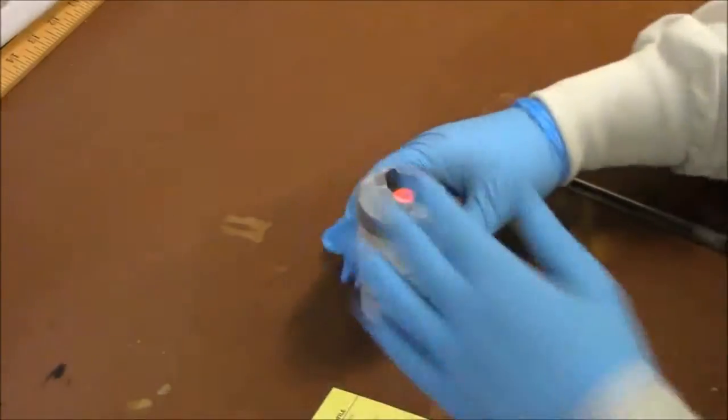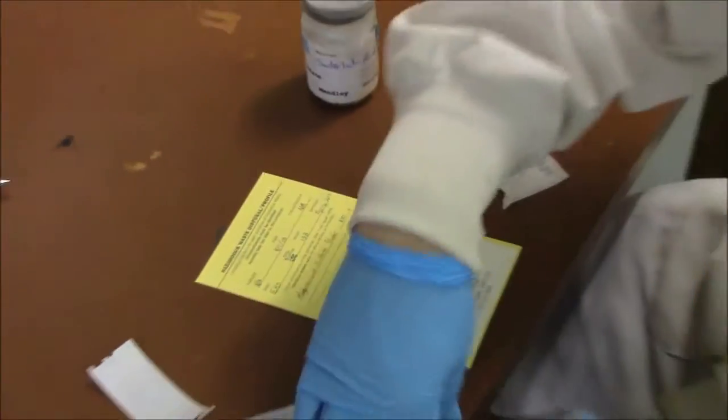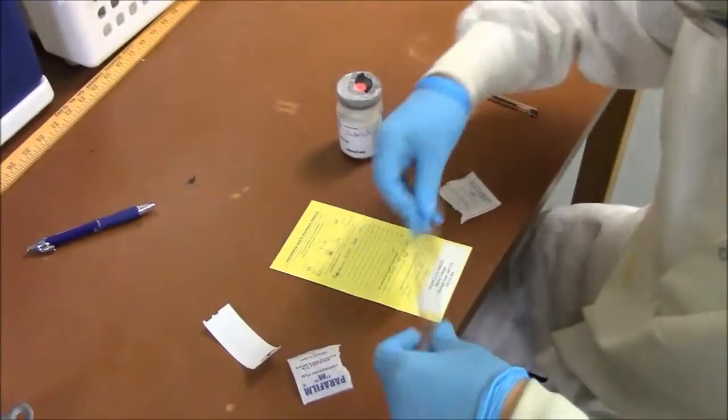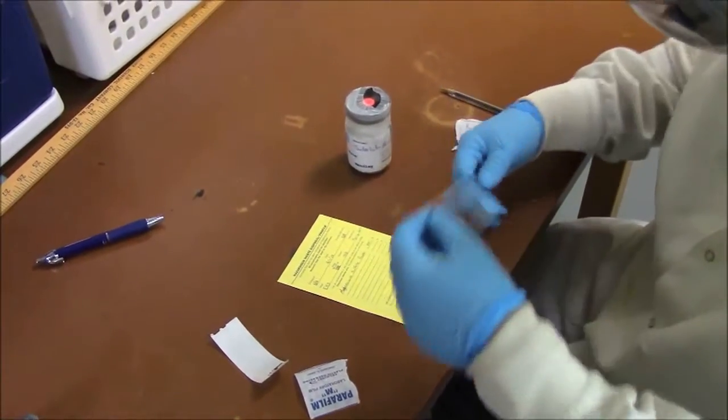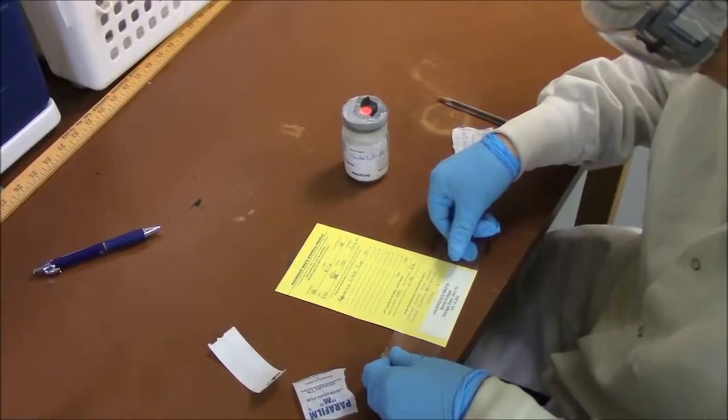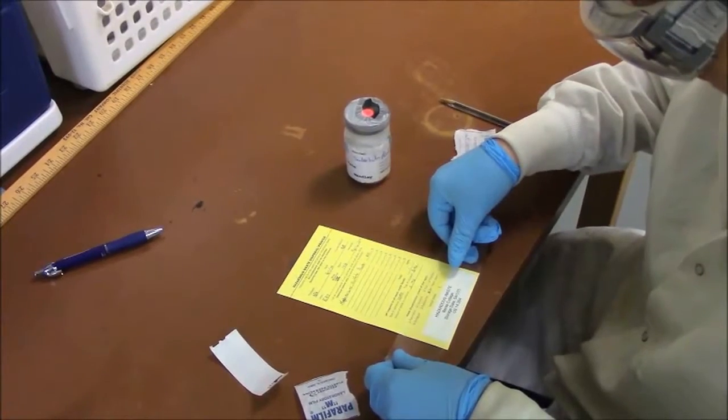After you get the top completely sealed, you're going to put your waste card on the chemical. Every chemical that is being wasted must have a waste card attached to it.